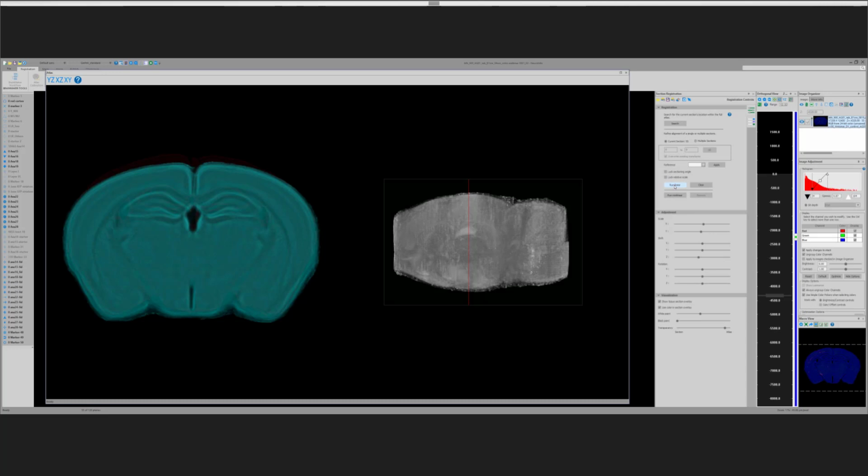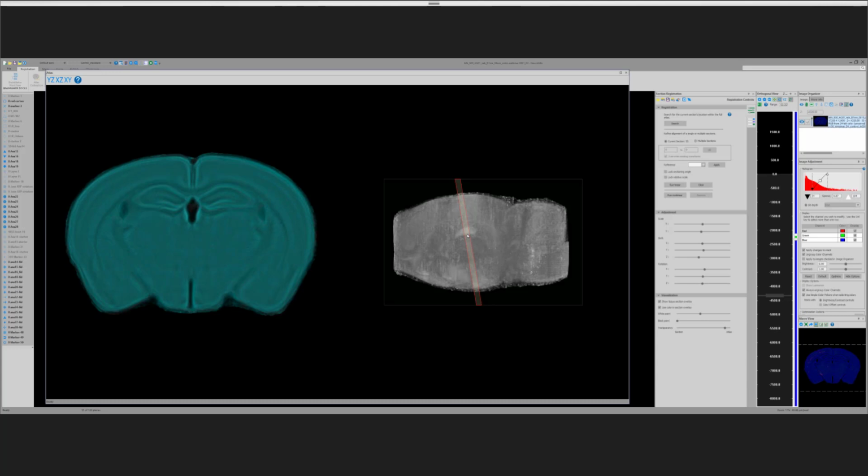Now the program itself is going through, and Brian, you might describe what the program's doing since you wrote this part. Yeah, sure. I think that's great the way you went over all of those parameters. The way I like to think about this is that the red plane basically represents the plane that the knife cut through the brain while you were sectioning. And we have all those parameters that model how that knife sliced through the brain during the sectioning process.